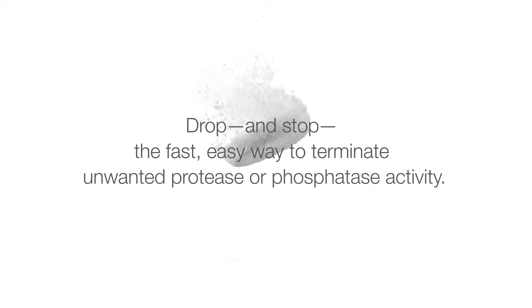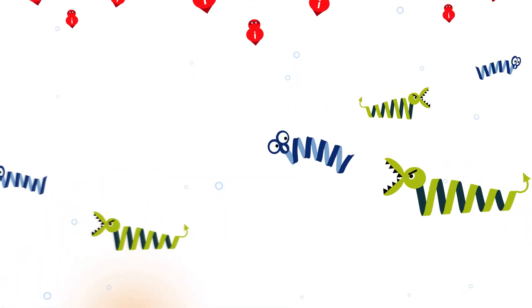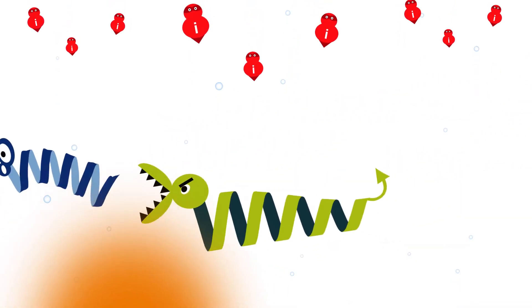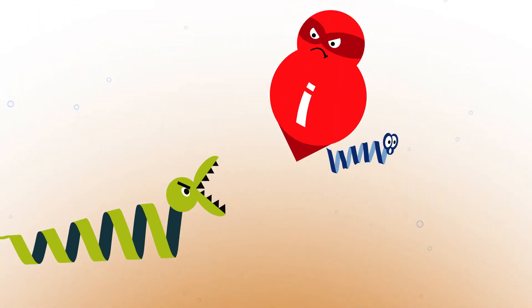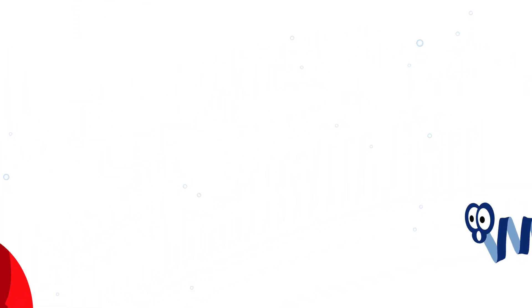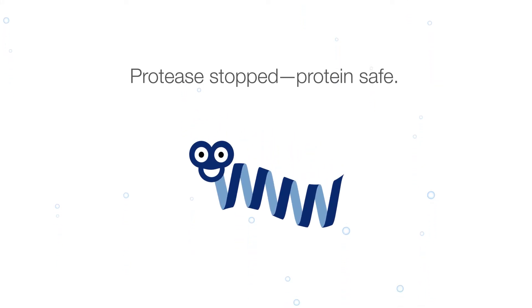Drop and Stop — the fast, easy way to terminate unwanted protease or phosphatase activity. Protease stopped. Protein safe.